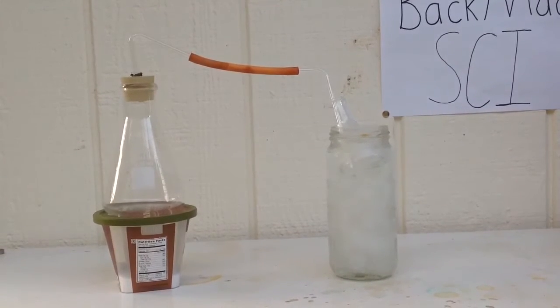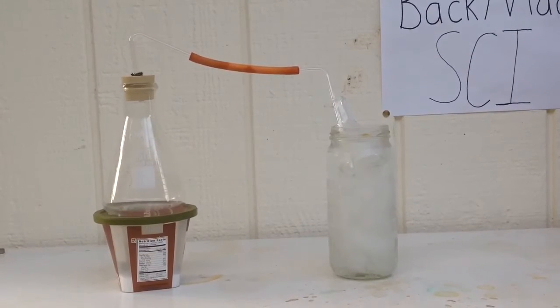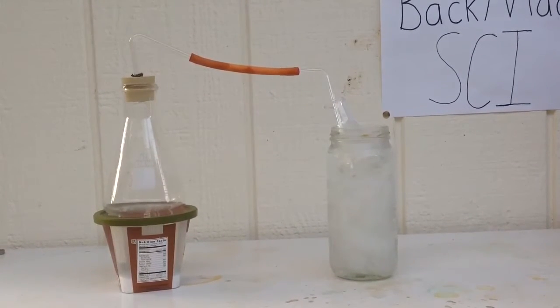The stopper, glass, rubber, glass setup that I showed you earlier should be connected to the flask and the glass 90 degree tube should be going into the mini flask.